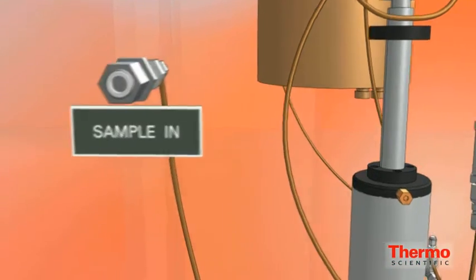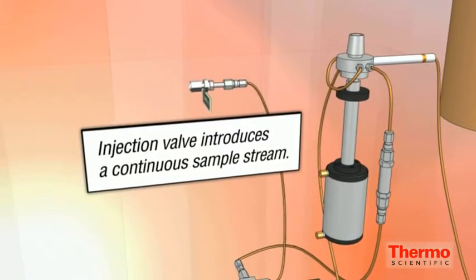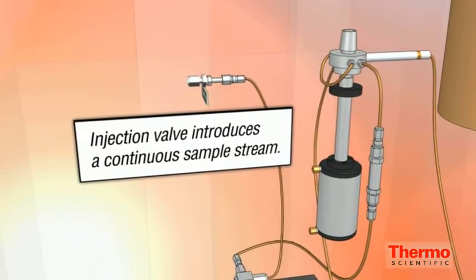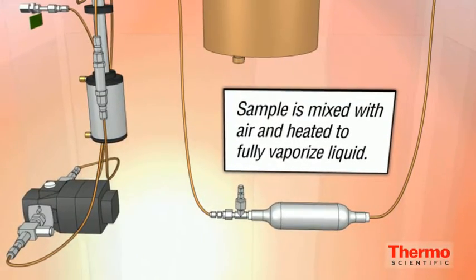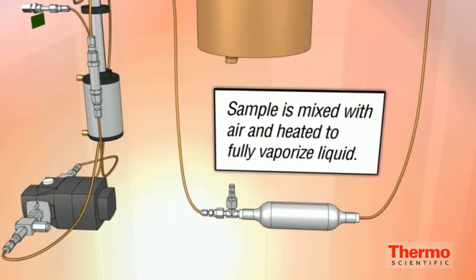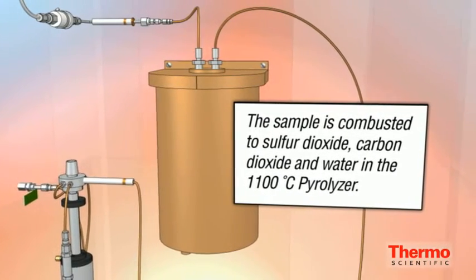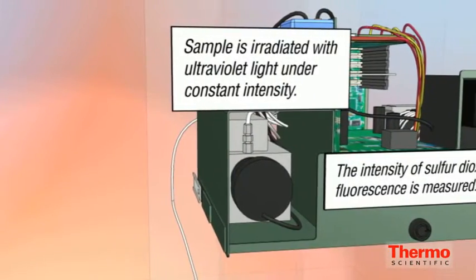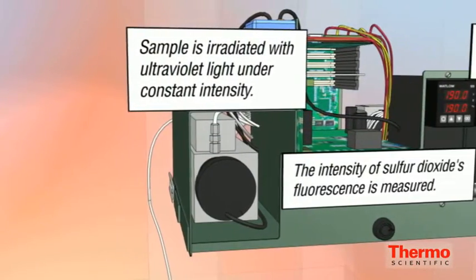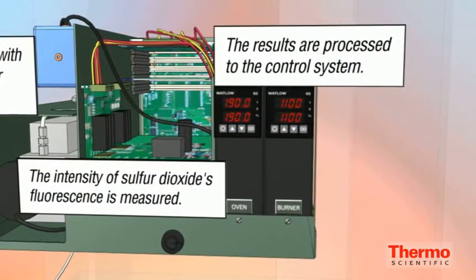An automated liquid sample valve is used to pulse sample into the air bath oven. Air is used as the carrier gas and oxidant to ensure safe operation in potentially explosive atmospheres. Upon entry to the combustion furnace, all components of the sample are oxidized to carbon dioxide, water, and sulfur dioxide. The PUVF spectrometer measures the amount of sulfur dioxide by a process called pulsed ultraviolet fluorescent.